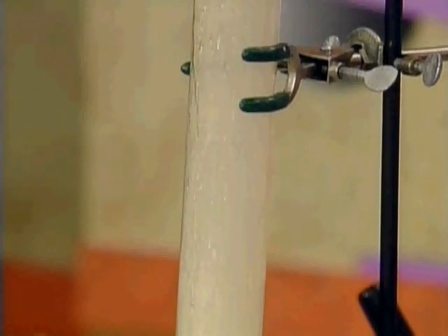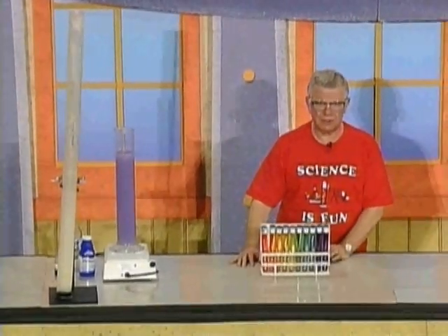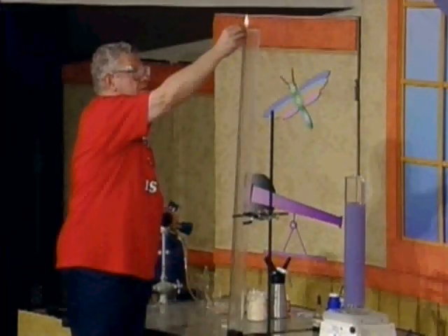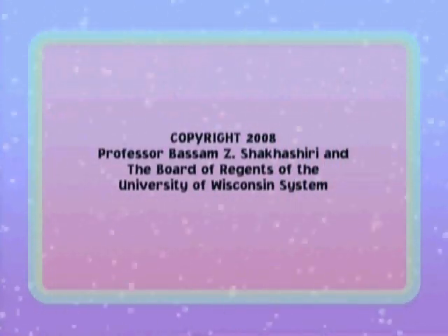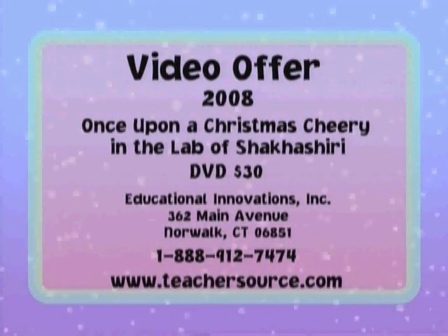As you look inside the tube now, you can see that there is some sulfur deposited on the inside. Let's take a look at this in slow motion — just watch the monitor. You'll be able to see the match being dropped down, though there's no sound. That is the combustion reaction of carbon disulfide with N2O.